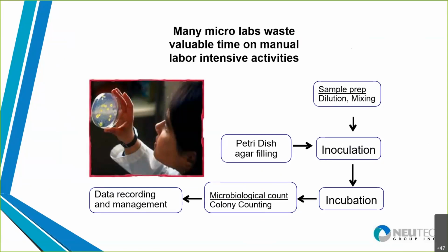And then you've got to make your media. So how do you fill those petri dishes? And you've got hot agar running around the laboratory, and is it being poured correctly? And then at inoculation, are you preventing cross-contamination using good practices to make sure you're not bringing in organisms that aren't supposed to be there? And then once you've got the inoculation and you've grown it, how do you count it? Is that a manual thing? And trying to do counts all day long gets very tedious, can lead to mistakes because you're looking at the same thing again and again. And then how's that data recorded and how's it managed?